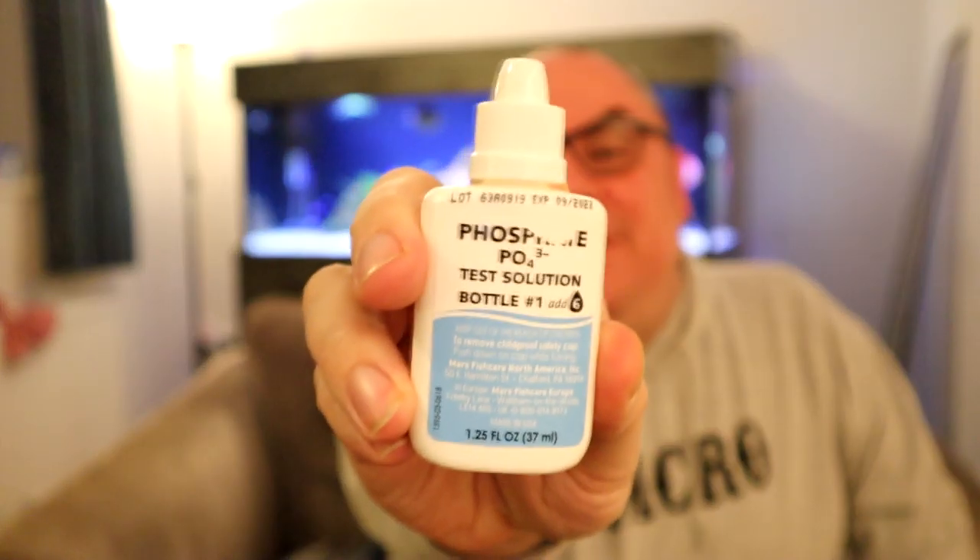So other than a general curiosity about what's going on in my water, one thing I was trying to check was the hardness. On the API kits you'll see an expiration date up at the top, and I noticed that the kit was out of date so I got myself a new one. I thought it would be interesting to see if there's a difference between the out-of-date ones and the new ones, because quite often you get people on the internet saying don't use out-of-date kits. So I'm going to go through the different test kits I've got, test the water from this tank, and we'll compare the results at the end.